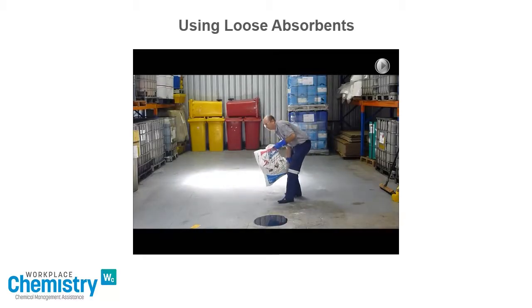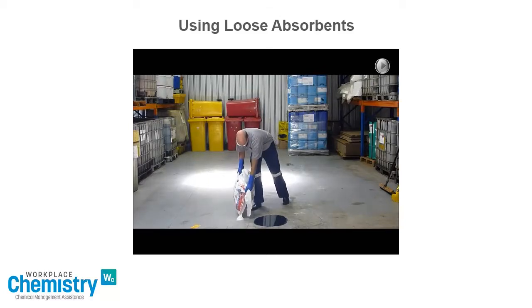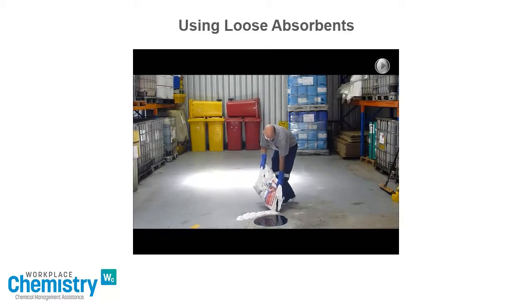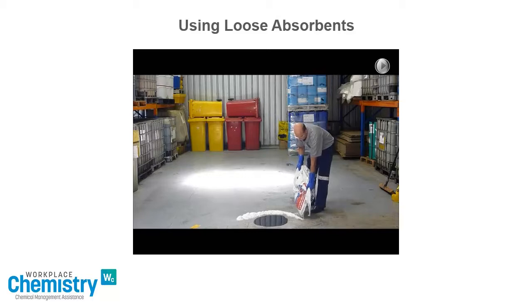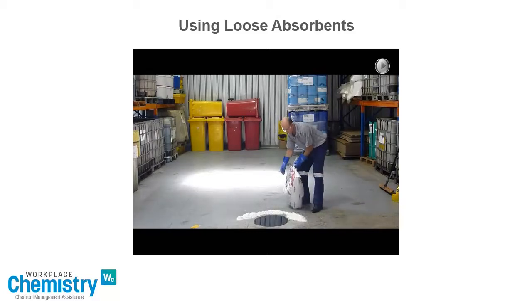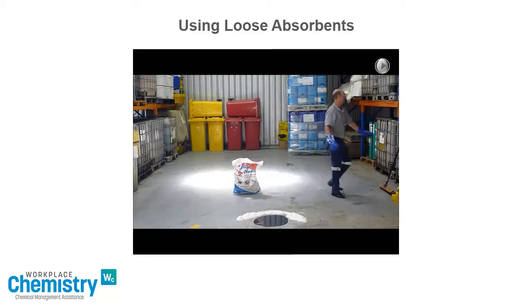Here we have a small oil spill. We can use loose absorbent to stop the spread of the spill by pouring it across the spill's path. We pour the absorbent next to the spill to avoid splashing. This is particularly important when cleaning up hazardous chemical spills.